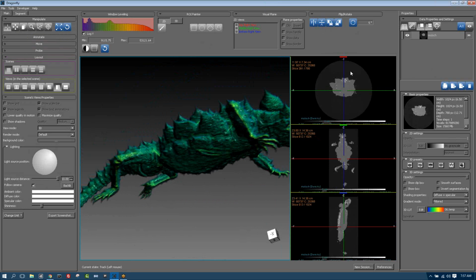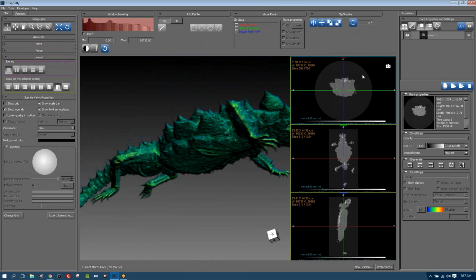When I apply an action button, they are in blue. So the action buttons may apply like a vertical flip, or horizontal flip, but when I apply those flips, I'm still in the track state. So now you see the blue buttons affect an action, but they don't change the state you're in. So if you want to change the state, those are modulated by the gray buttons.